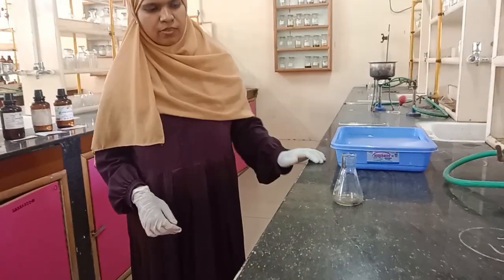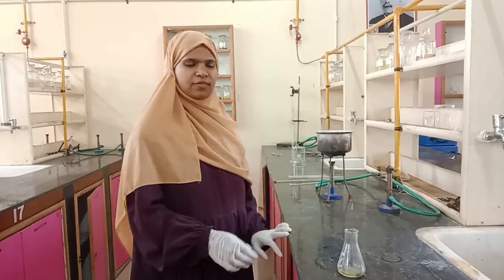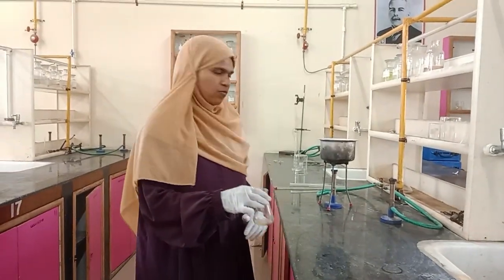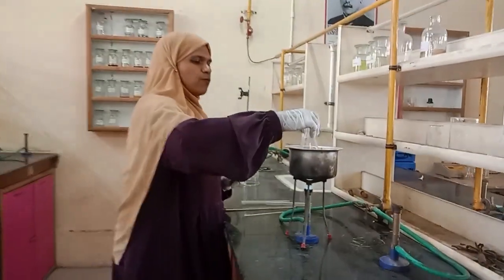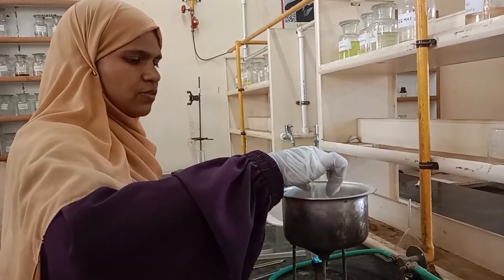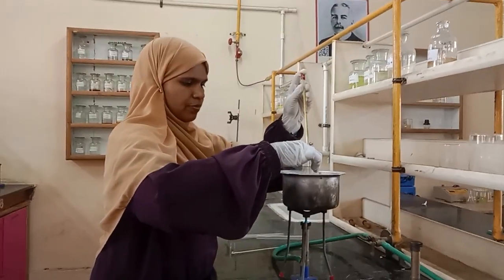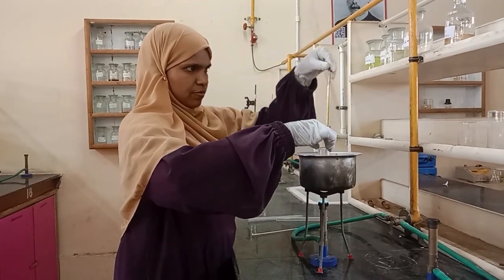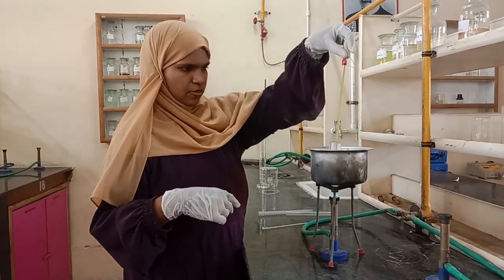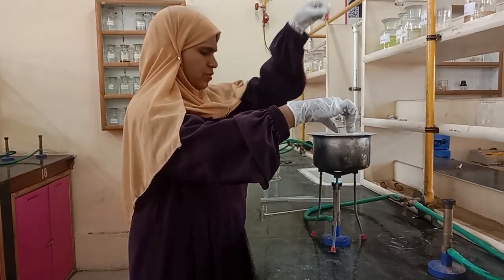Let this mixture stand for some time at room temperature. After that, we warm it in a water bath up to 40 degrees Celsius. You measure the temperature. Okay. Slightly warm it.